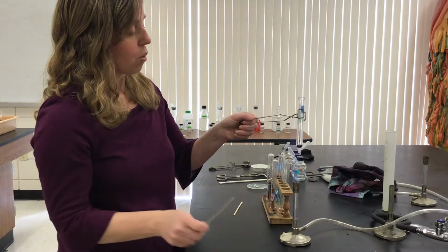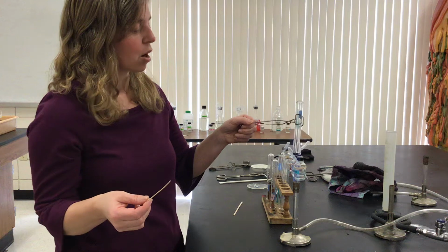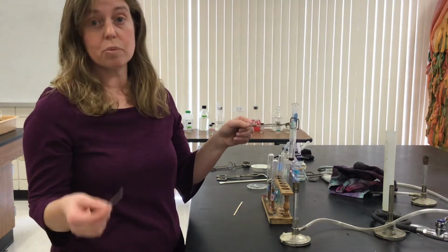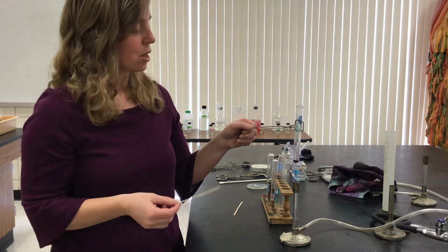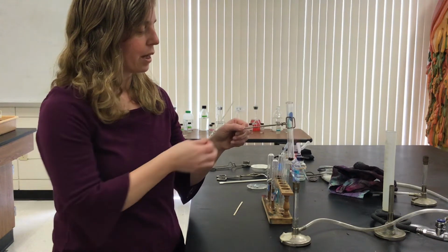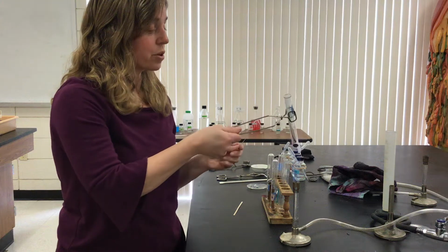So how do we test for this? How do we know we're creating carbon dioxide gas? Because we can't see it, because it's colorless, right? And it's odorless, so we can't smell it either. So what we can do is a flame test. We're going to light this wood splint on fire, okay? When we do that, it should act as a fire extinguisher and extinguish the flame.